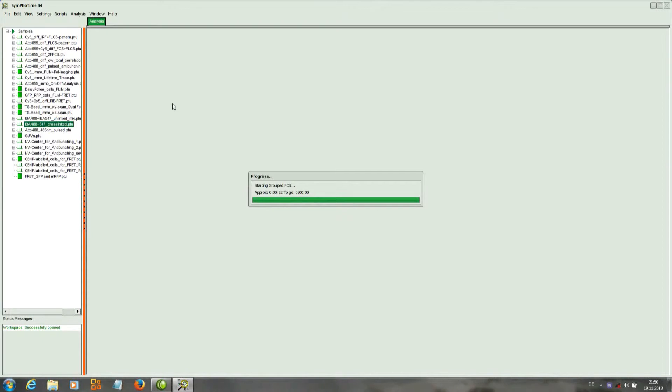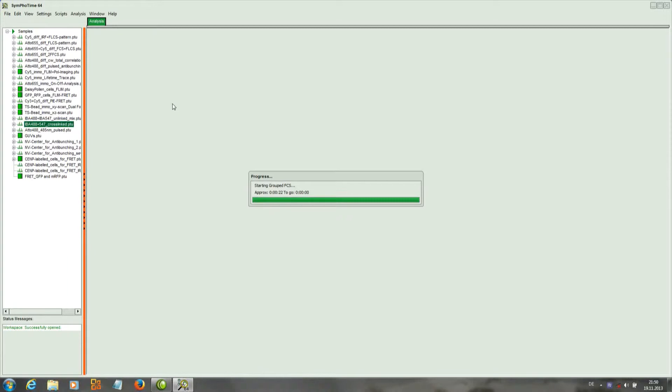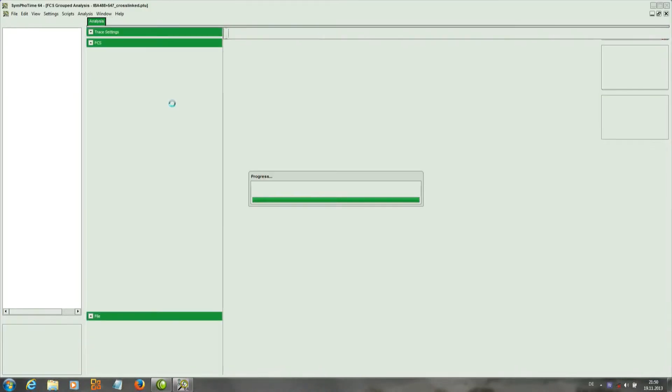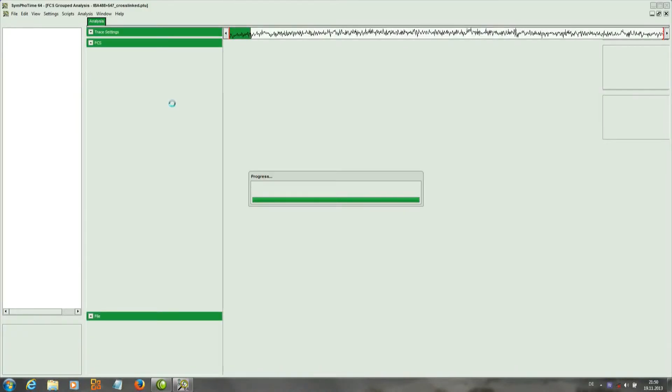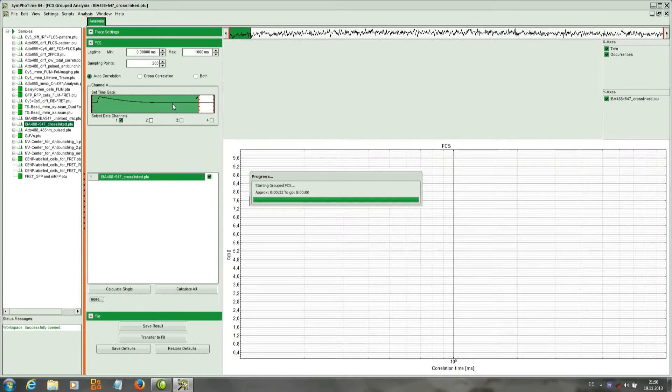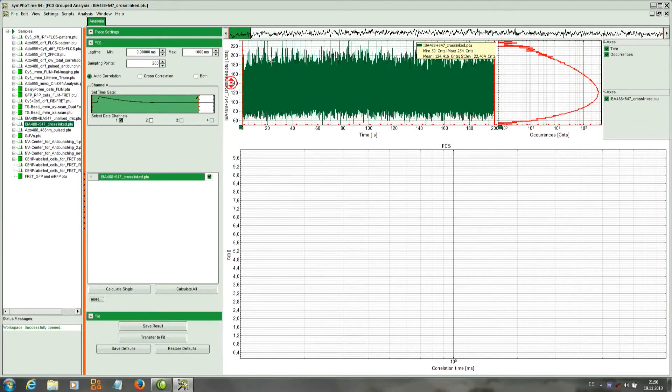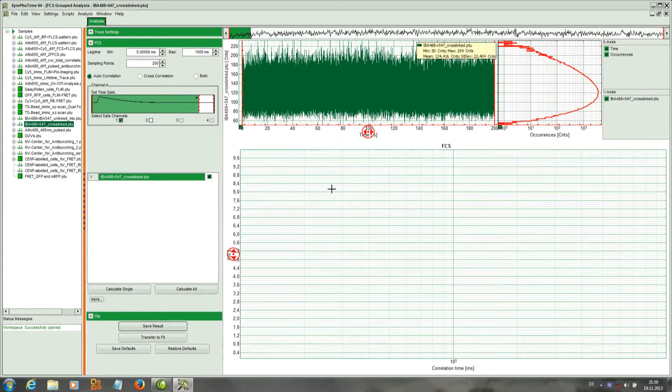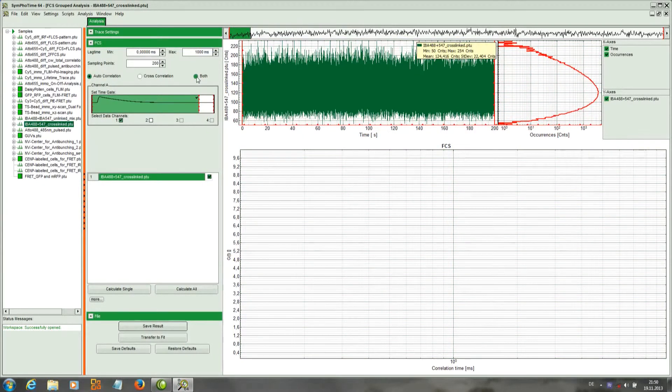When the data is loaded into SymPhoTime and the script is applied, first a window opens. In this window, we have the parameter area, the time trace, and here the FCS curves will be plotted.